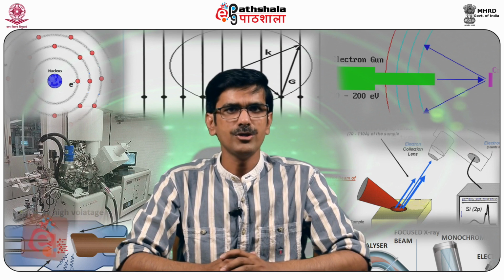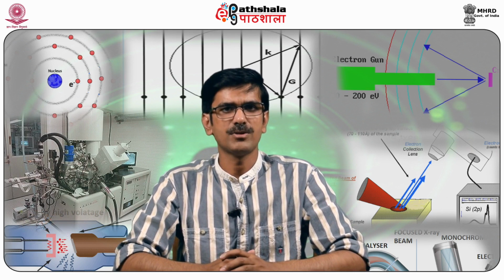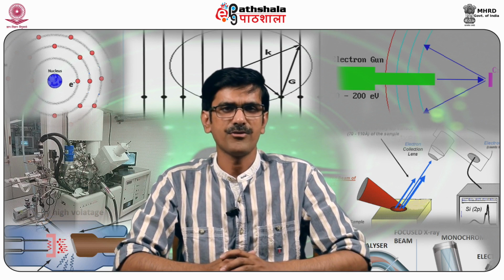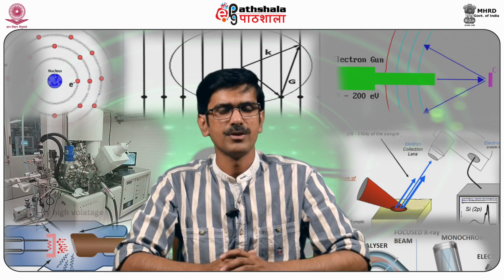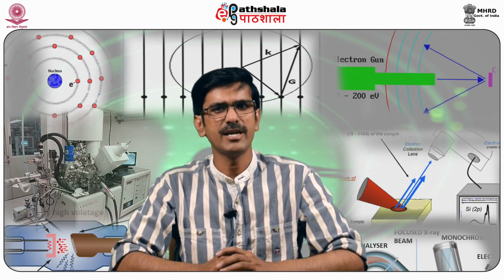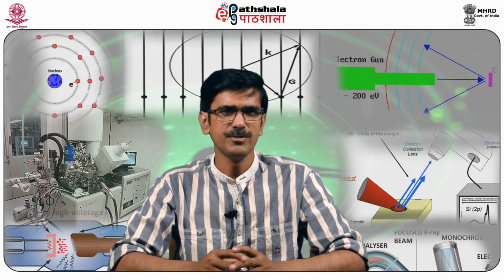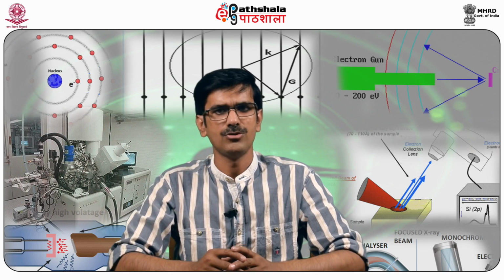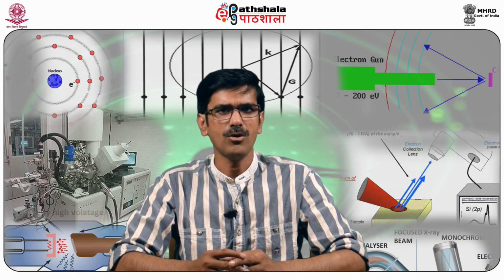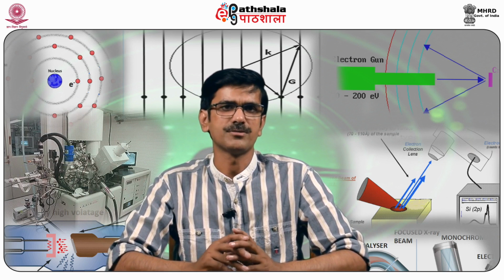Today, we are going to discuss the module Analysis of Energy Dispersive X-ray Spectroscopy under the paper Surface Analytical Techniques 2. As the name suggests, analysis means detailed examination of elements or structures of a material. Similarly, in this module, we will study how to interpret the data obtained from an EDX spectrometer.